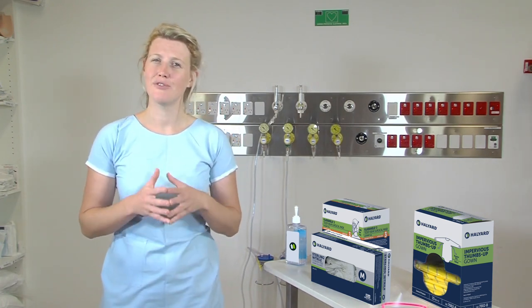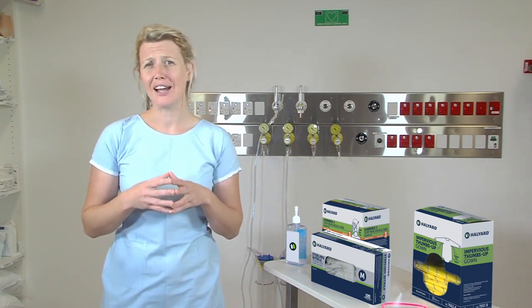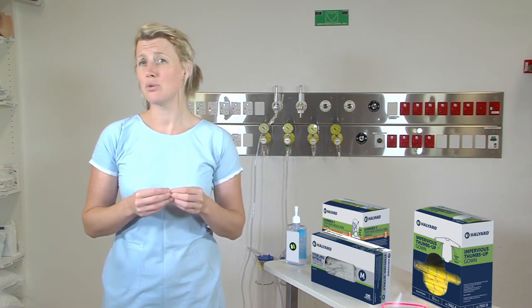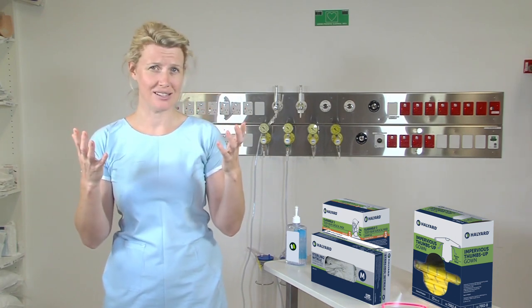Before you get started there are a few things that you need to keep in mind. Firstly, are you using a consistent sequence to don your PPE? The sequence you should be using is: body first, face second, hands last.